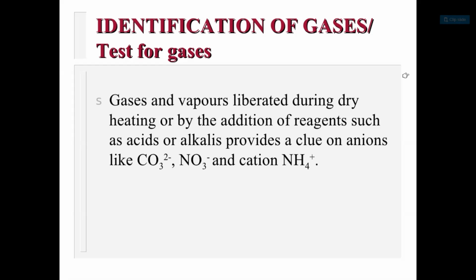We have talked about solids, liquids, and gases, for example oxygen, hydrogen, carbon dioxide, and ammonia. There are many kinds of gases, and some of the noble gases. Today, we are going to talk about the identification of gases and what tests we can do to identify different kinds of gases.